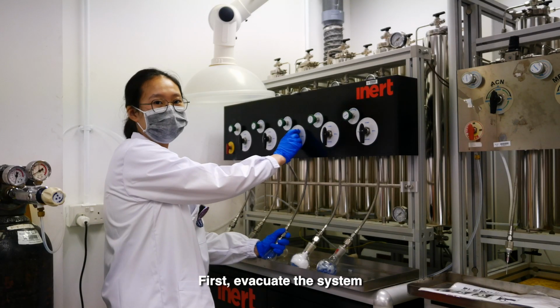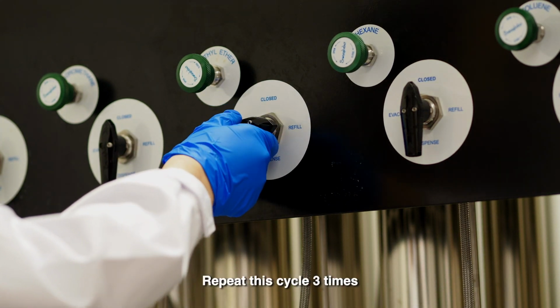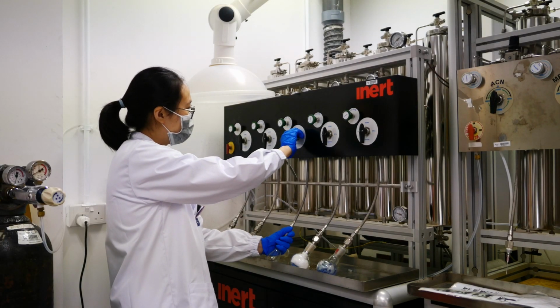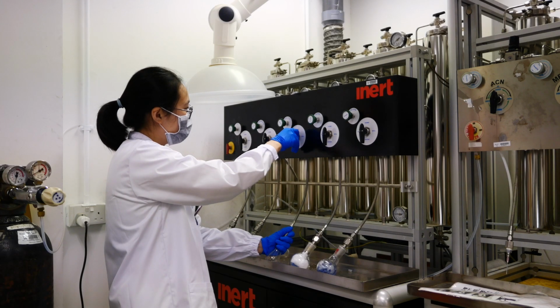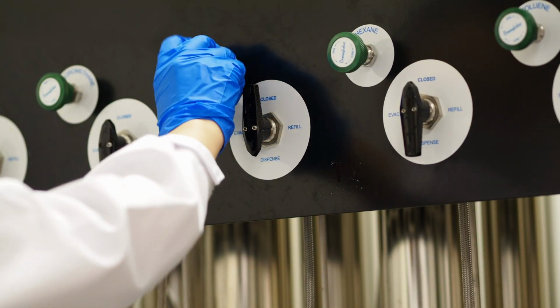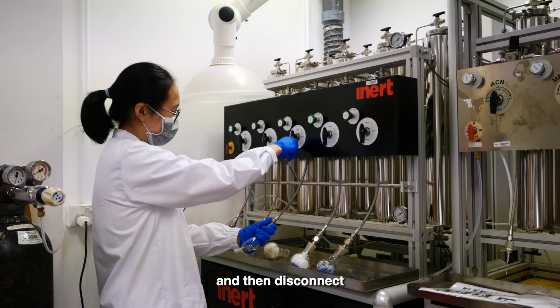First, evacuate the system, create a vacuum inside, refill it with nitrogen, repeat this cycle 3 times. Switch to dispense and get your solvent. Take the amount you want, refill it with nitrogen, and then disconnect it.